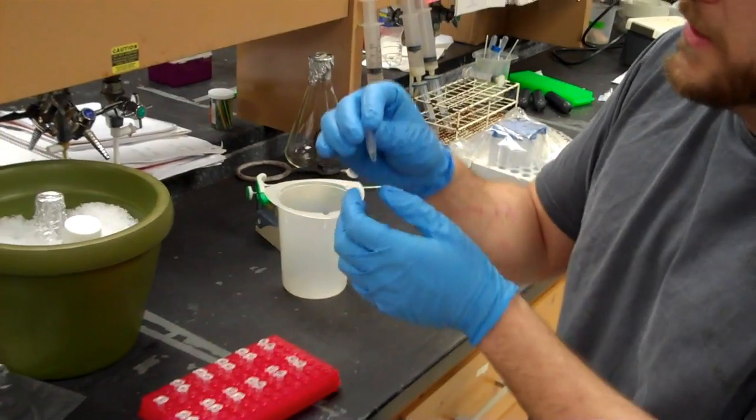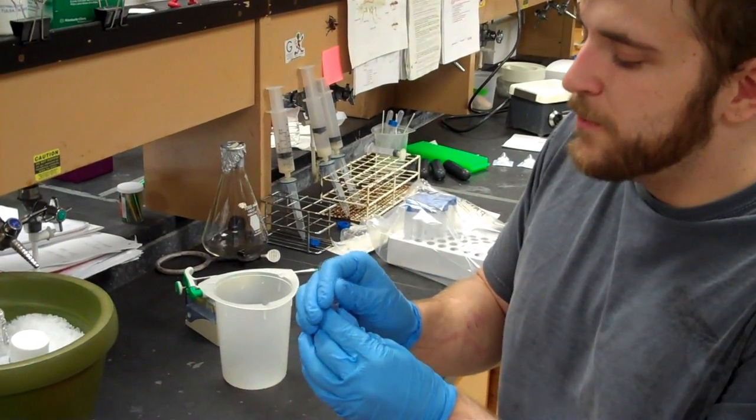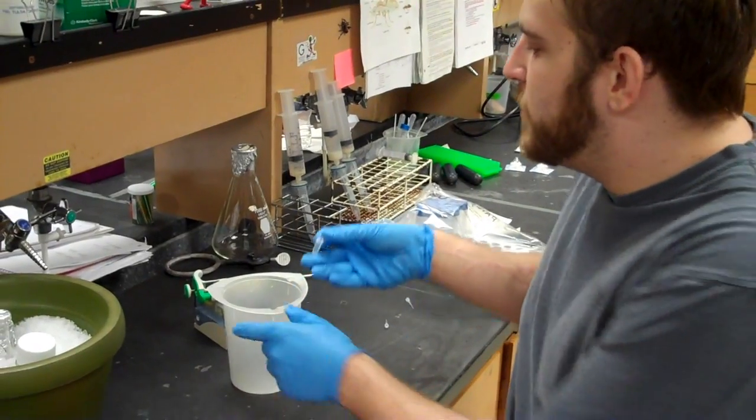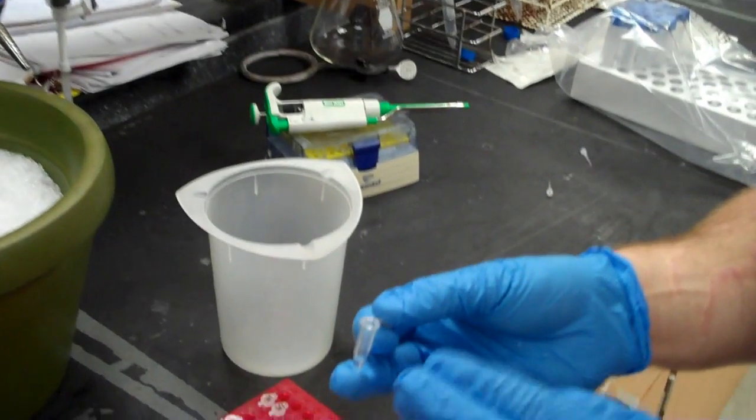The supernatant here is 95% ethanol, which is what's used to separate the oligonucleotides from the rest of the solution.